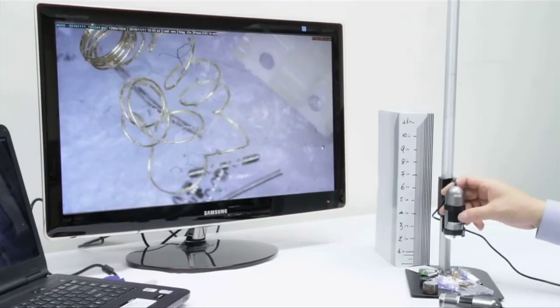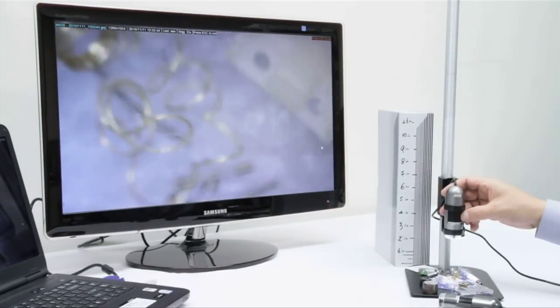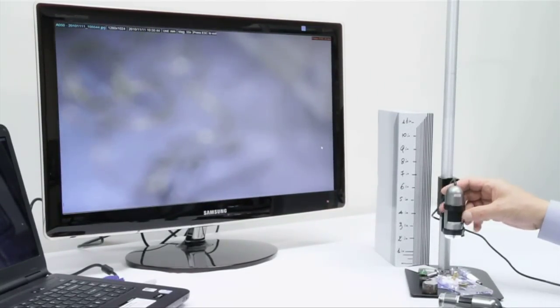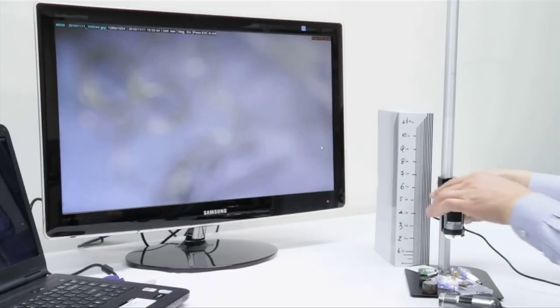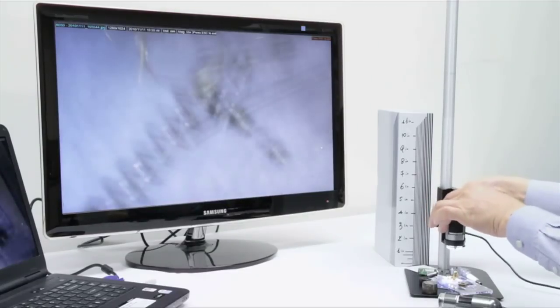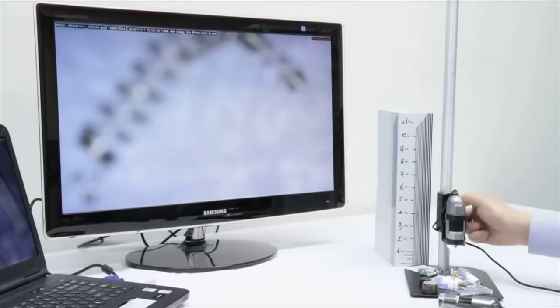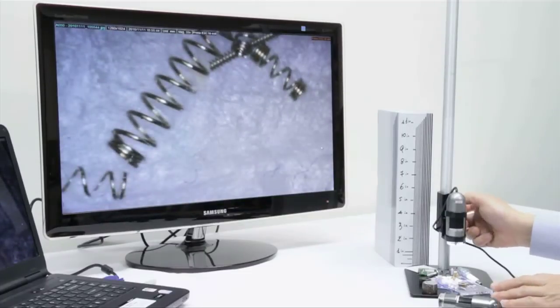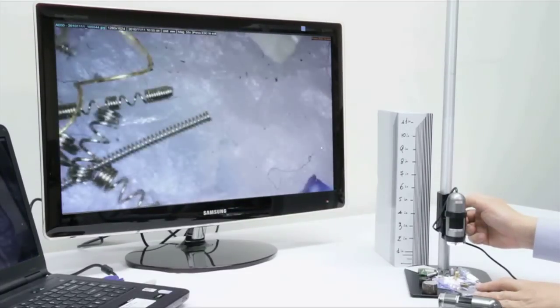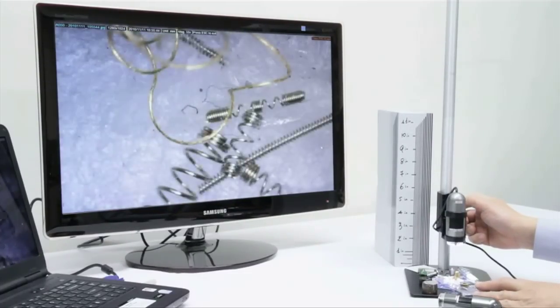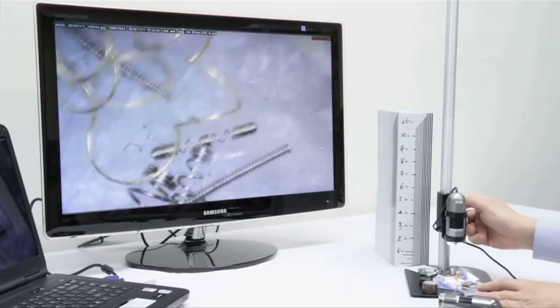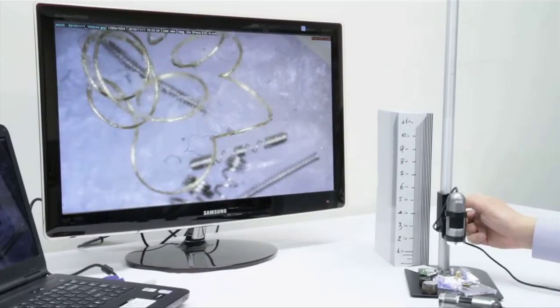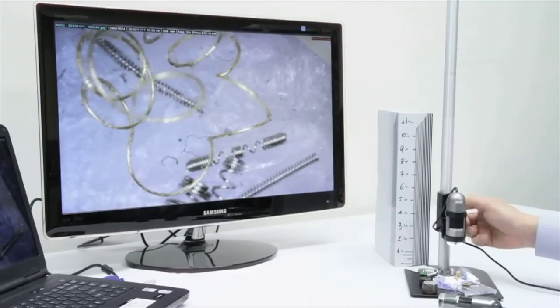For example, right here we're at 55 times the magnification. If we want to move to 80 times the magnification, we'll just set it to 80 on the side of the microscope, and then we can move our microscope down from there. When we get into focus, then we will know that we are at 80 times the magnification.